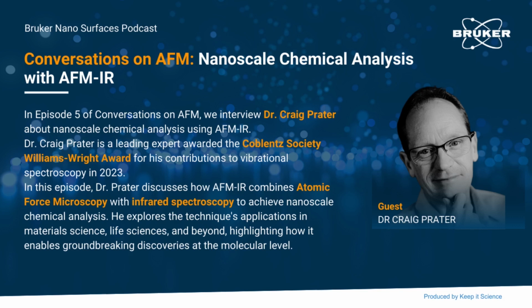It was my pleasure. So dear listeners, that's all that we have time for in today's conversation. We have covered a wide range of topics, everything from Alzheimer's disease to material sciences. We have focused on AFM-IR, which is a technique that integrates AFM with infrared spectroscopy to deliver nanoscale chemical analysis. And we even touched on a more advanced technology, which is OPTIR, and even spoke about how we can combine AFM-IR with OPTIR.